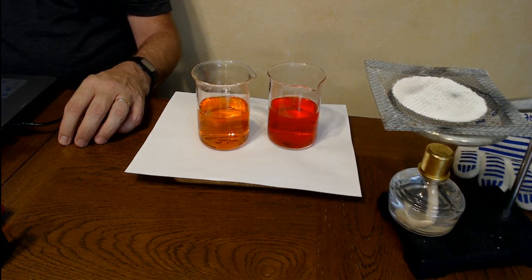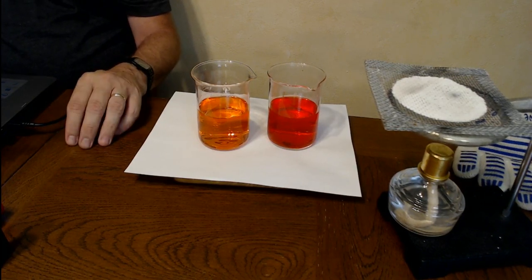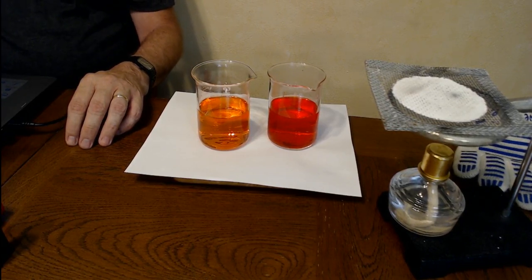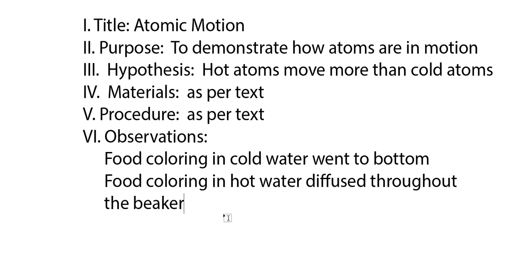Okay, it's been about 15 minutes, and we finally have it diffusing through, so it took quite a lot longer. So let's record that under observations.